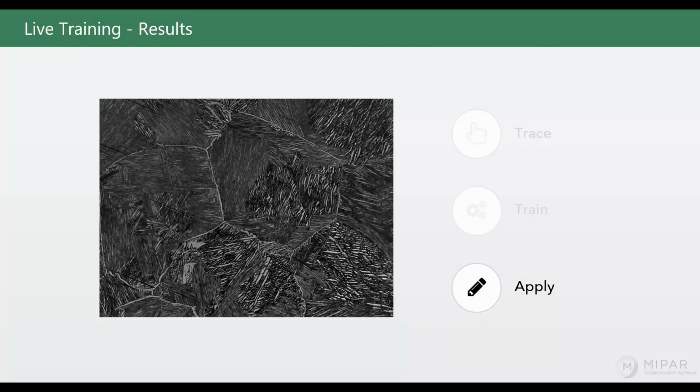So we've seen the deployment of a very powerful technology that allows great accessibility to take expert input from metallurgists and microscopists, continuing to do what they've done for so long by manually marking up their images, and then allow this deep learning training engine to take over from there, learn from it, automate what used to be impossible problems, and we've been able to do so during the course of this webinar.